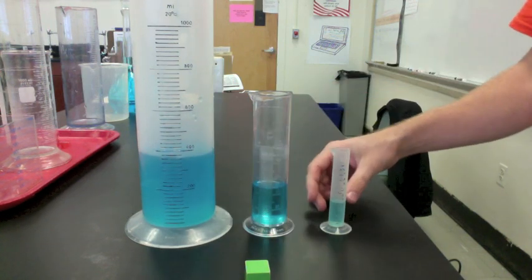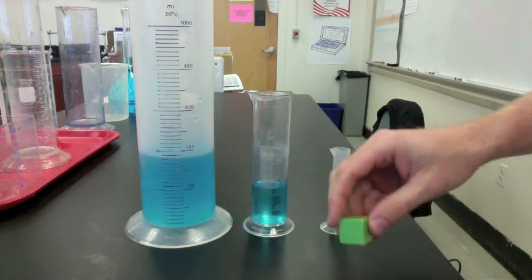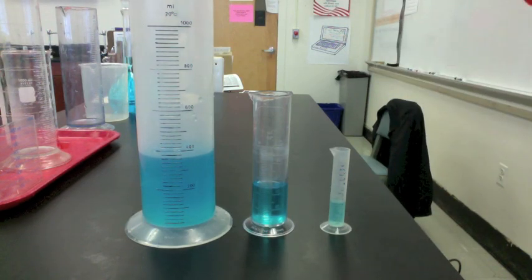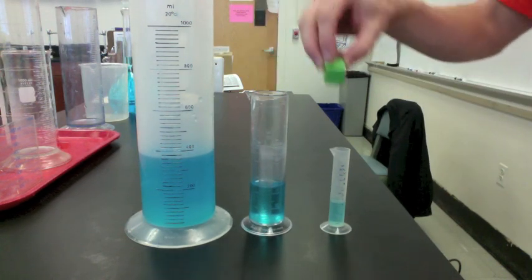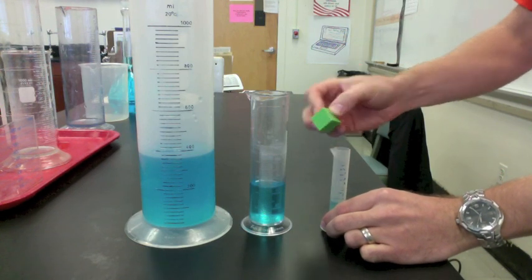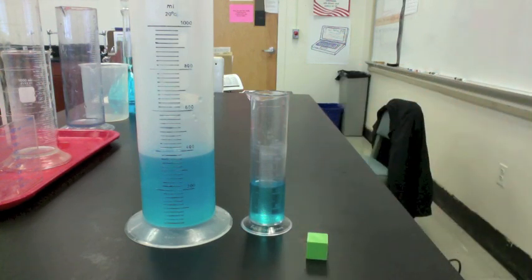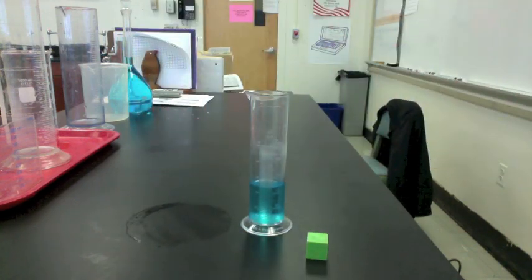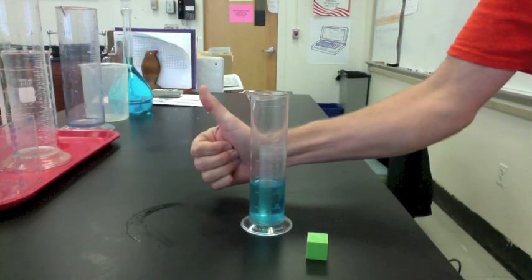First, we want to know which graduated cylinder to use. The basic rule is you want to use the smallest graduated cylinder you can without the object getting stuck — that will give you the most accurate reading. The smallest one will not work. The big one will give a reading, but not very accurate. This graduated cylinder is the one we want.